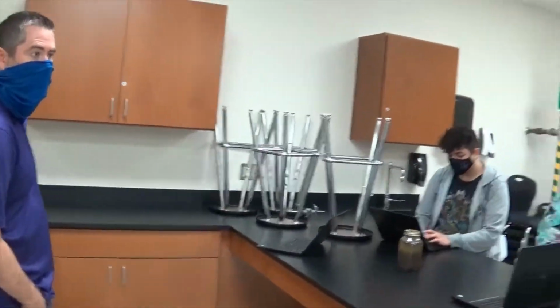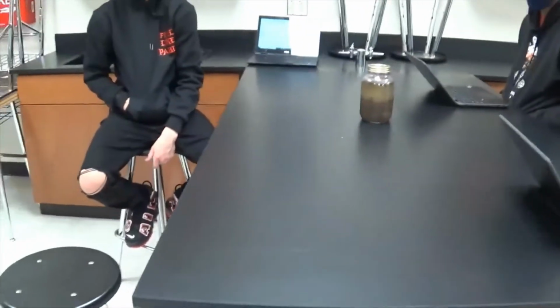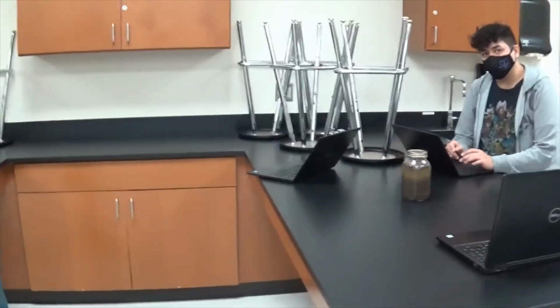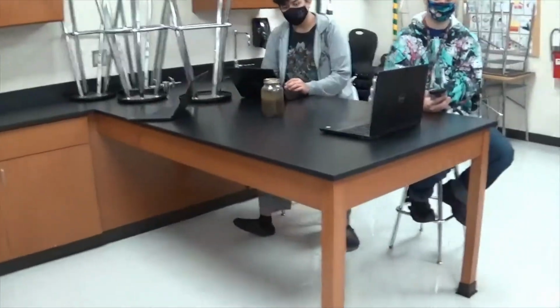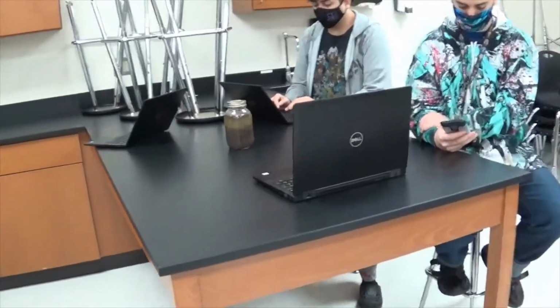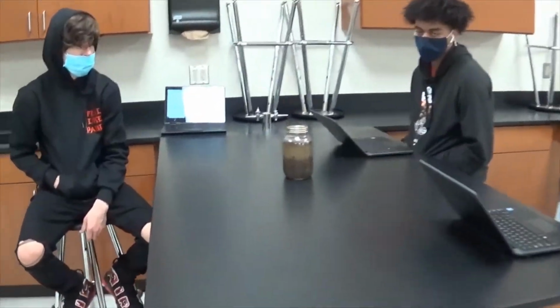If your soil is low on silt, then the fertility of the soil is going to be low quality. So what you need to do, and I have meter sticks up here on the counter, is measure the height of each layer in your jar.